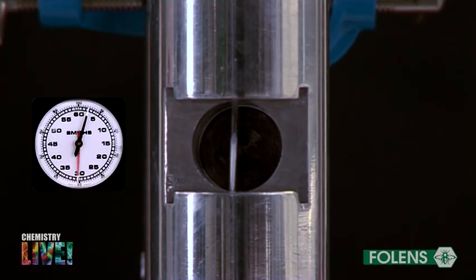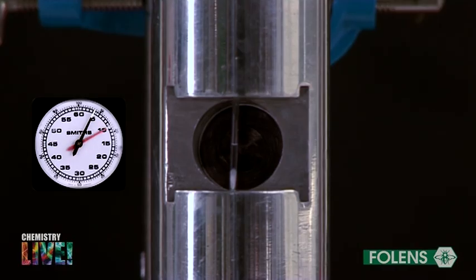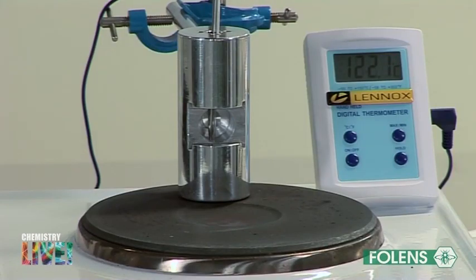Note the reading on the thermometer at which the crystals begin to melt. Also note the temperature at which the crystals finish melting. These two temperatures are the melting point range of the benzoic acid.